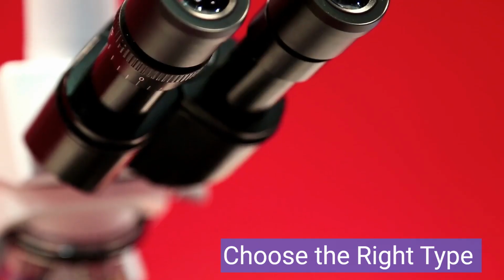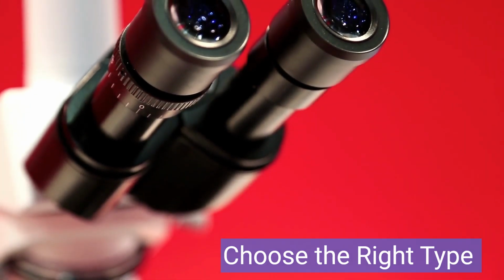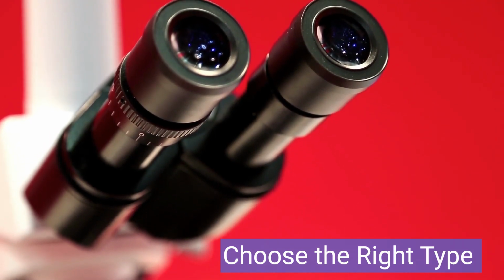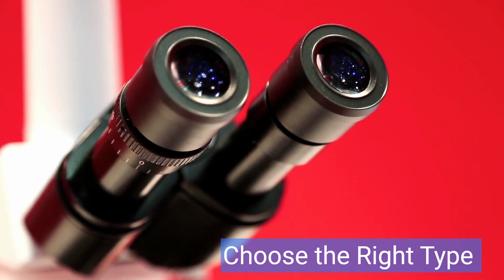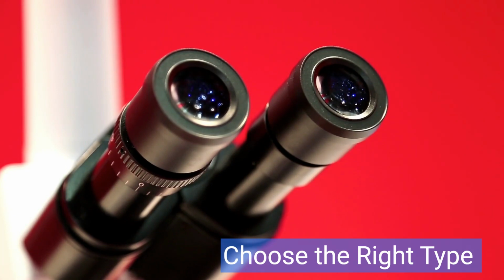Step 2. Type of microscope. There are several types of microscopes, including compound microscopes, for viewing small specimens, stereo microscopes, for larger objects in 3D, and digital microscopes, for capturing images and videos. Choose the type that suits your study needs.